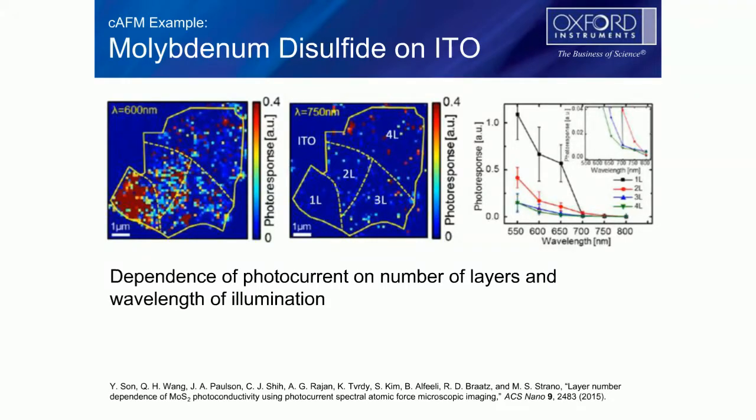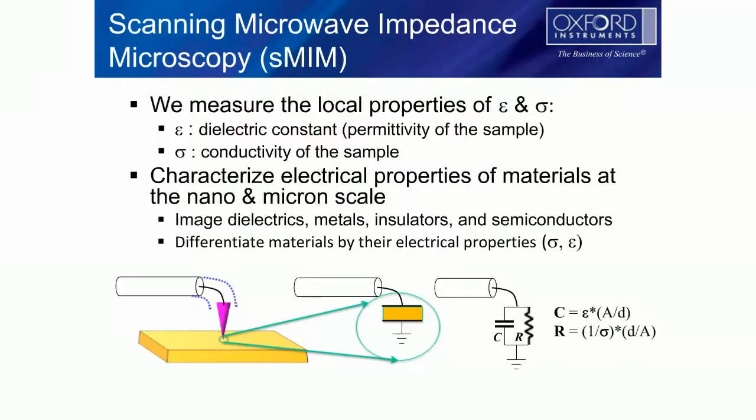This is also, because of this illumination, and I don't recall which instrument this is put on, we recently introduced the Infinity, and I just got mine in my lab, where we can actually take a fiber. The original one was installed with Frank Hamrijo down in Colombia. But I have a copy of his, and we can actually run a fiber from the bottom, whatever wavelength, whatever fiber you want. It just accepts the fiber. So it makes this kind of work a little bit easier. Sorry for the plug. It's required.